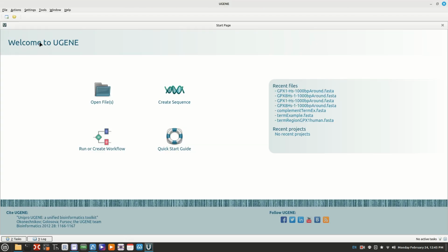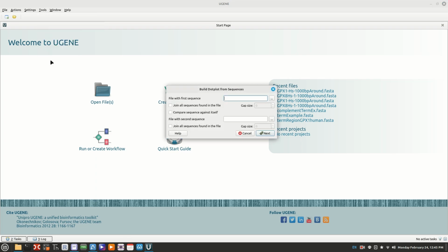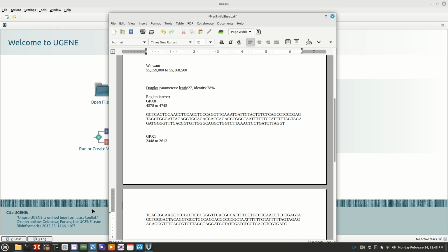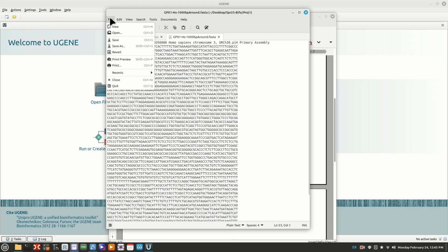Open. All right. And just to confirm everything, you know what, let's first make FASTAs. So we have our two sequences here. Let's turn these into FASTA files, but let's not do it the way we've been. Yeah, I guess we do have to make two.